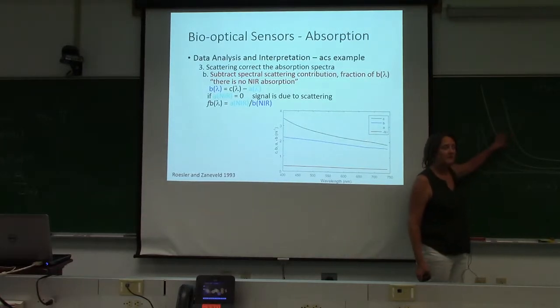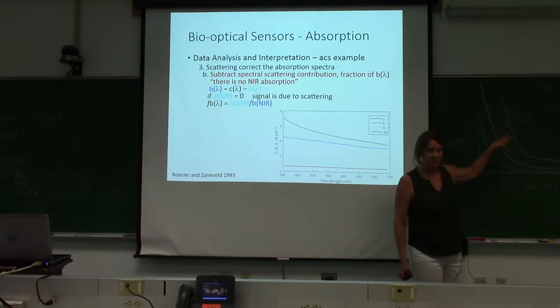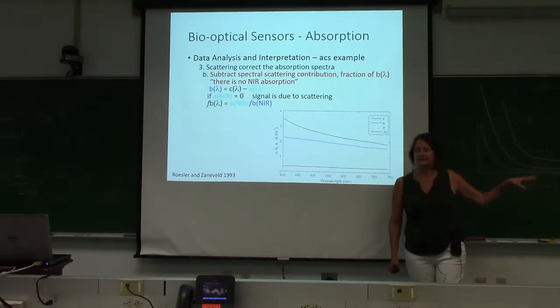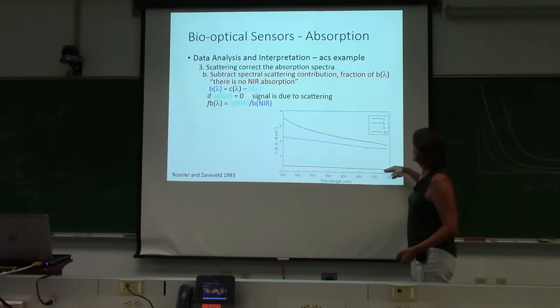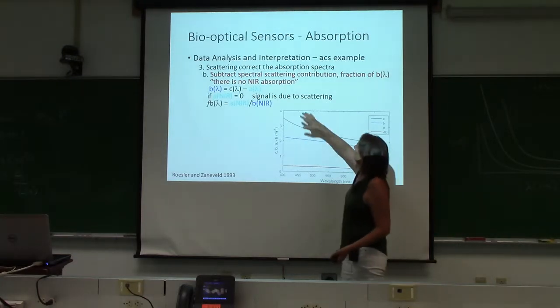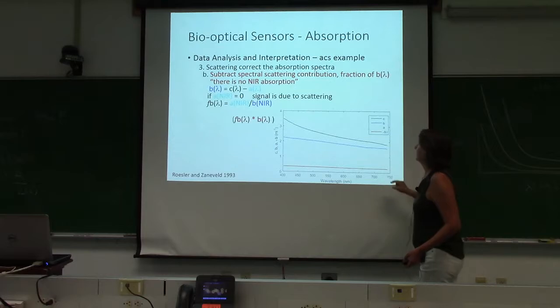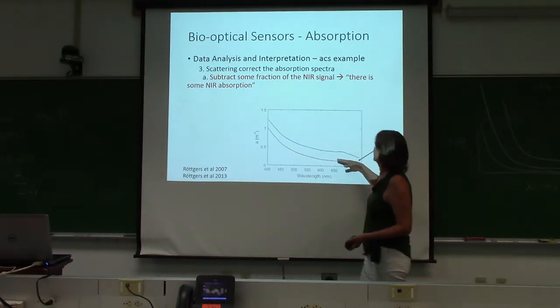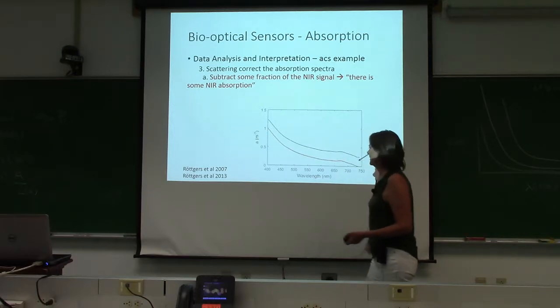Which becomes really interesting when you talk about dissolved or almost dissolved particles, really small particles, because they have a very strong spectral dependence of scattering. And so then I'm going to assume that there's no signal in the near infrared. And so we'll give you these equations. And what you would end up with is some spectral correction.